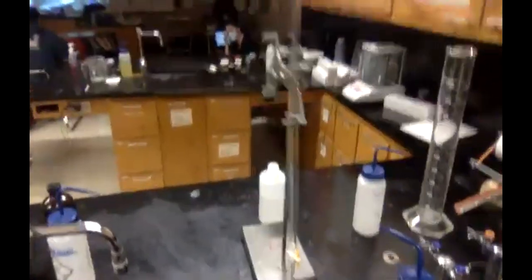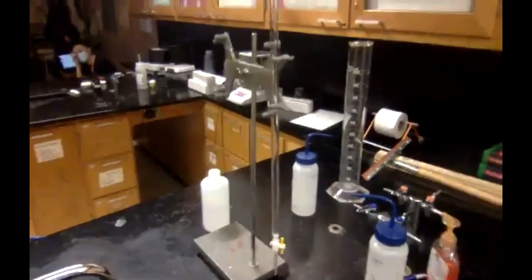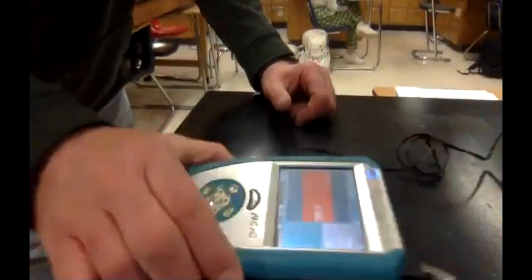So we take a look, you know this setup, this guy right here, this is the burette setup. This is the only new thing. Basically, it looks like this.